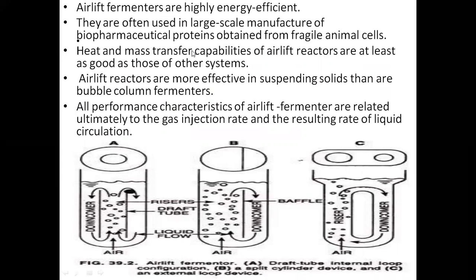They are basically very high in energy efficiency, and they are often used at large scales for the manufacture of biopharmaceutical proteins which are obtained from fragile animal cells. The heat and mass transfer capabilities of airlift reactors are as good as those of other systems.